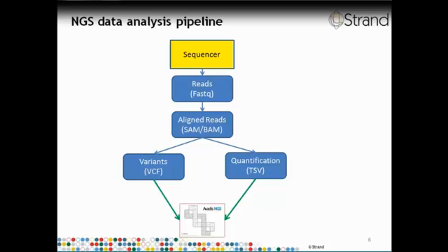What we'll do now is describe the different MiSeq applications. What is the data that is generated by the MiSeq run, that is, the software included with the MiSeq sequencer? Which of those data can be imported into Avadis NGS? What are the MiSeq specific import features which allow for a seamless integration of the MiSeq run and Avadis NGS, so you can use the best of both worlds? And after the data has been imported, how can the downstream analysis be carried out on the data? So let's start by taking a look at resequencing.